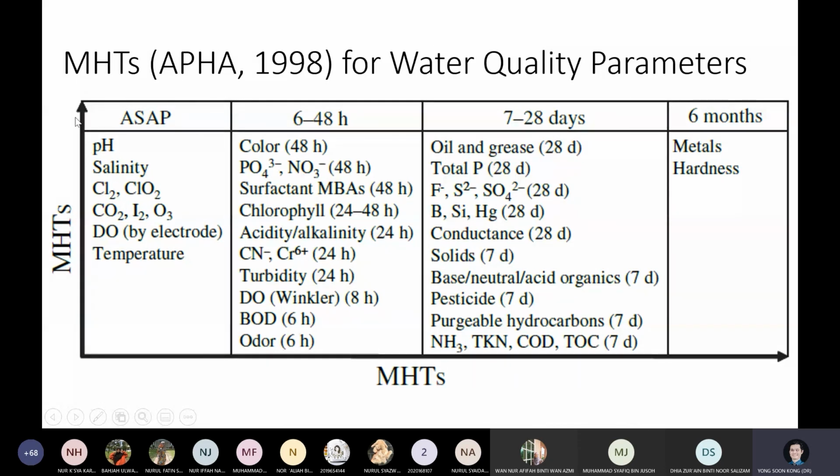So that is why in water resource technology, you have one equipment to bring with you wherever you want to go, and that is YSI, kan. You remember YSI?